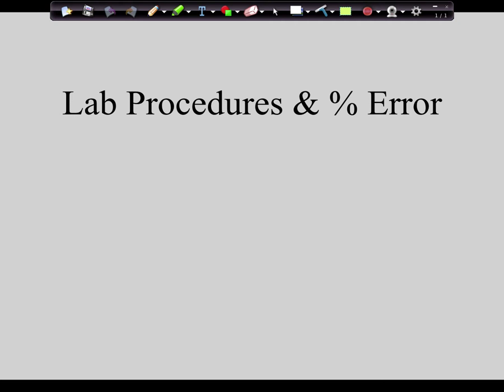So guys, here's what we're going to do today. Last time in class, you know that we got you introduced to the lab. What we actually did, though, is we taught you how to not get hurt in lab. What we're going to do today is we're going to talk about how you effectively work in lab. There are some skills that you need to have.